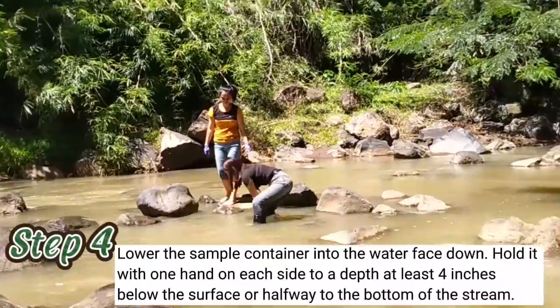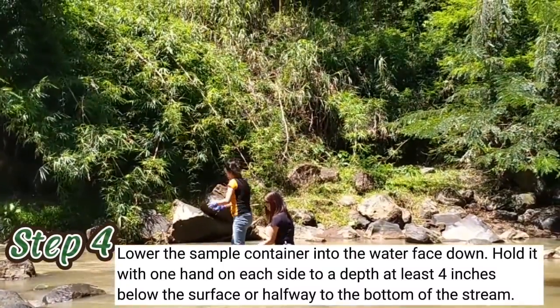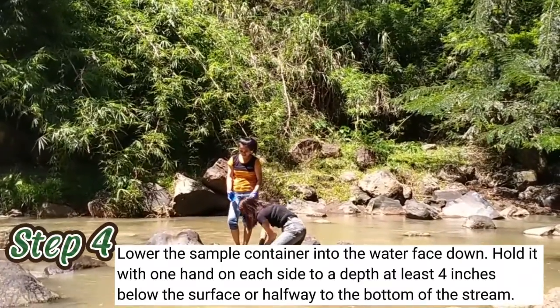Step 4: Lower the sample container into the water face down. Hold it with one hand on each side, submerged at least 4 inches below the surface or halfway to the bottom of the stream.